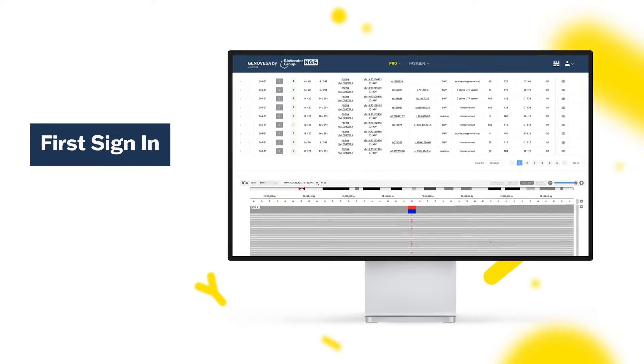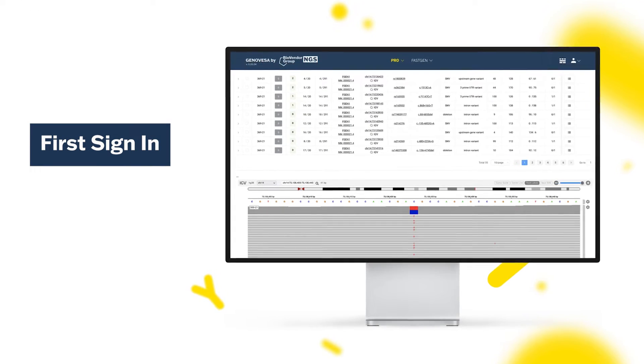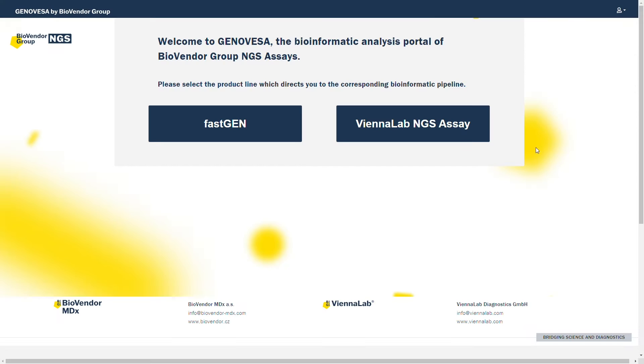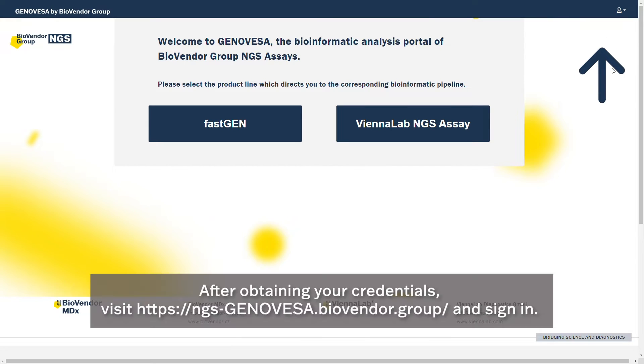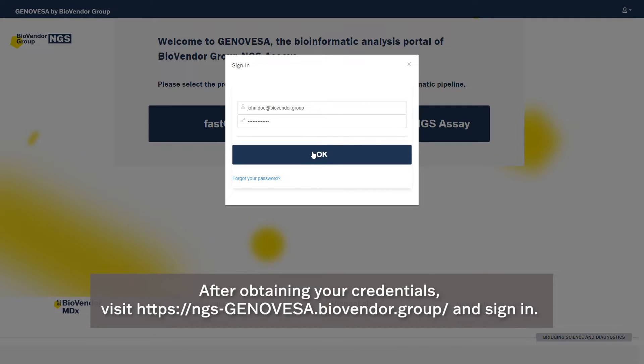First sign in. After obtaining your credentials, visit the Genovesa website and sign in.